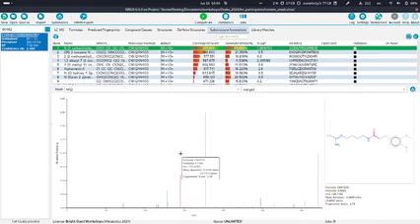So basically that's a combinatorial fragmenter like MetFrag built in, which shows you just another view on the data based on: can I fragment a molecule into parts that fit into my peaks? And hopefully most of the peaks should be purple, then it's a good sign that the fragmentation makes sense. There's an annotation.